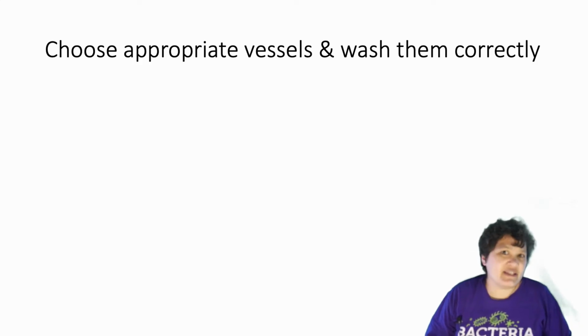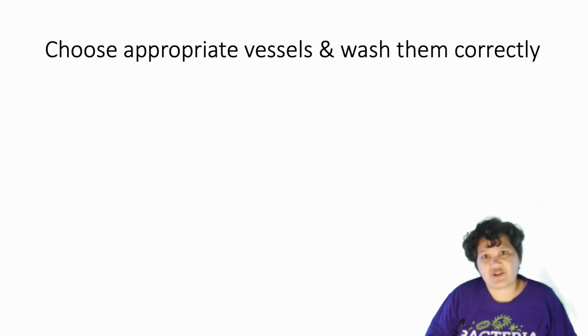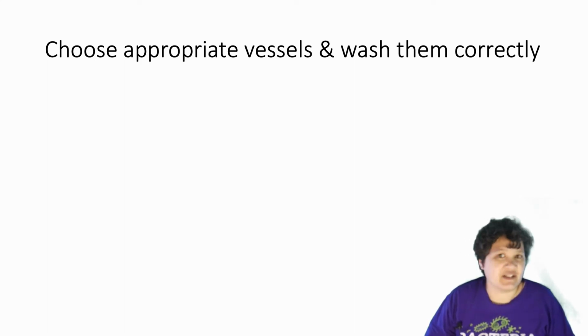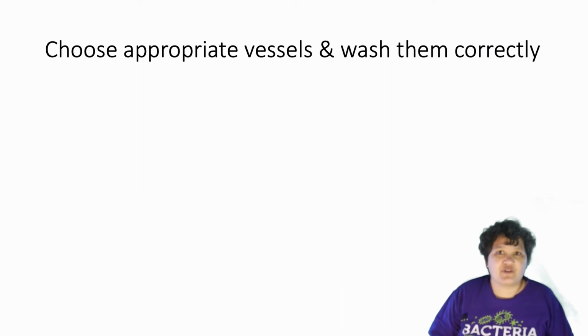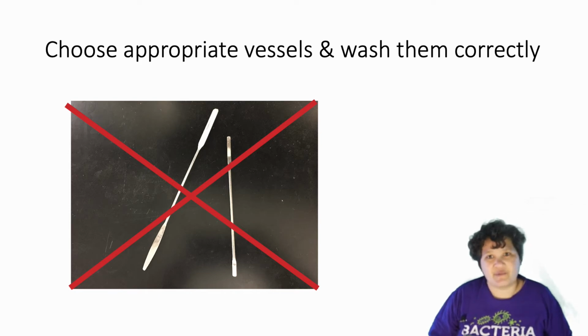So let's start with the easy part, which is trying to avoid contamination in the first place. How you do this is going to be very dependent on what your analyte is. But a very important thing to do is to choose appropriate tools to work with and make sure they are cleaned appropriately. For example, if you're looking at very small concentrations of metals, you don't want to use any metal implements when processing your sample because those implements could put small amounts of metal contamination into your sample.